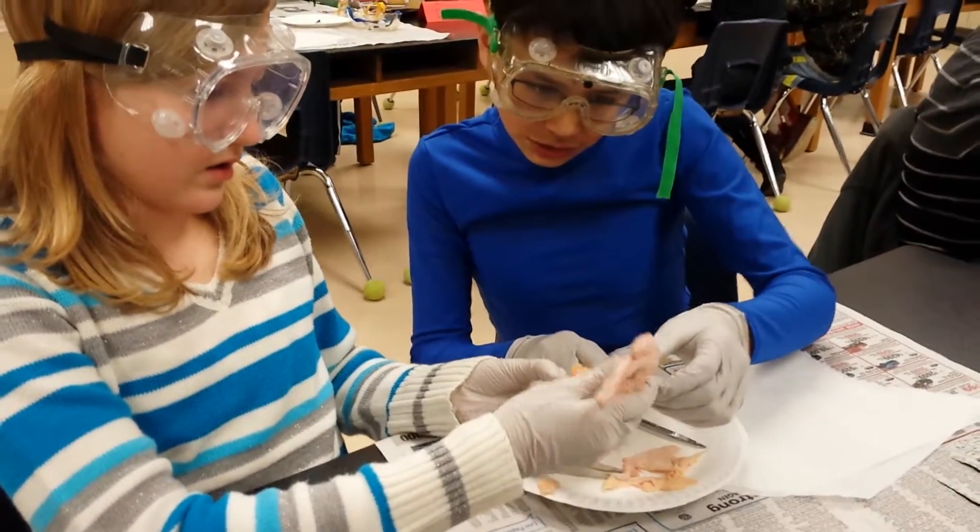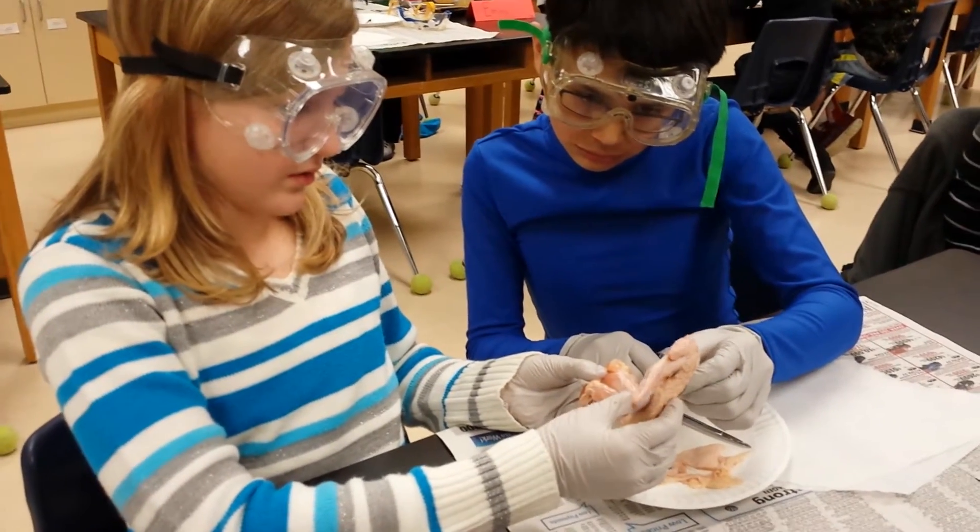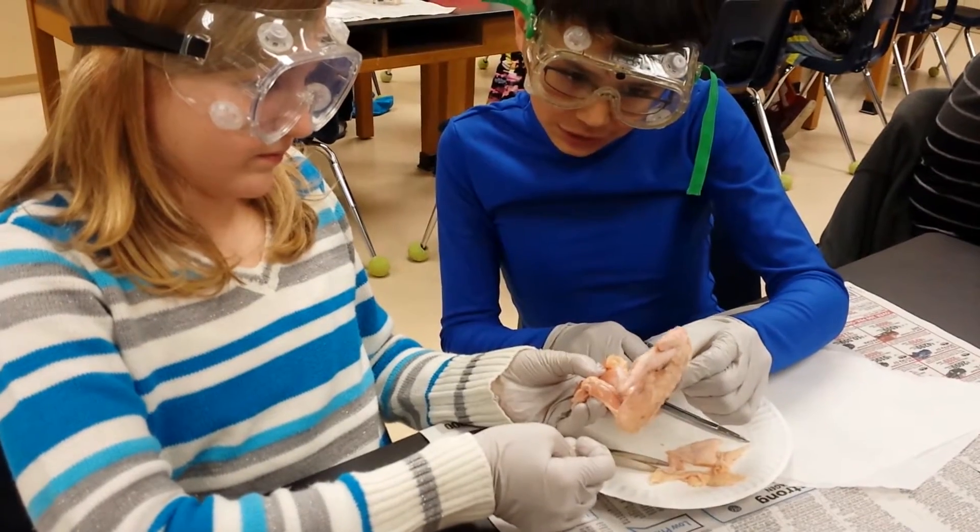What is it? Did you locate anything? We found a bunch of mussels. Hey look, if I squish it, it kind of goes tiny.